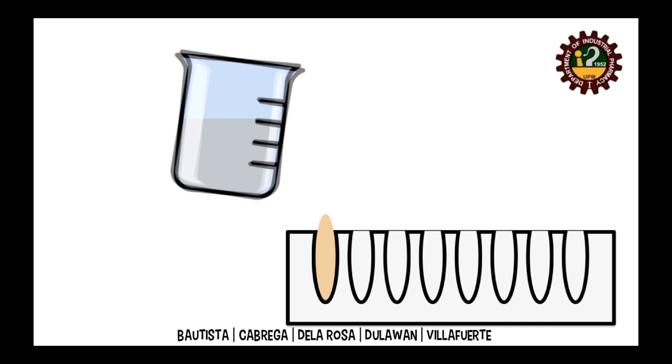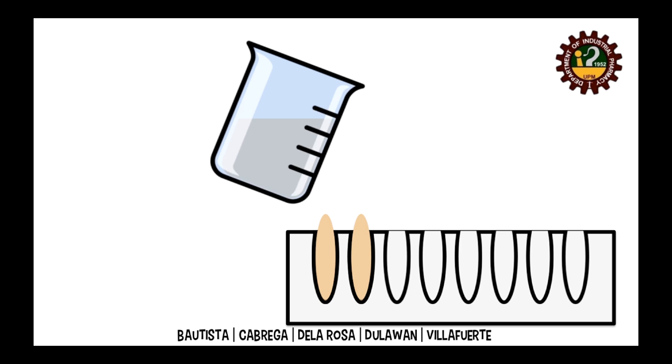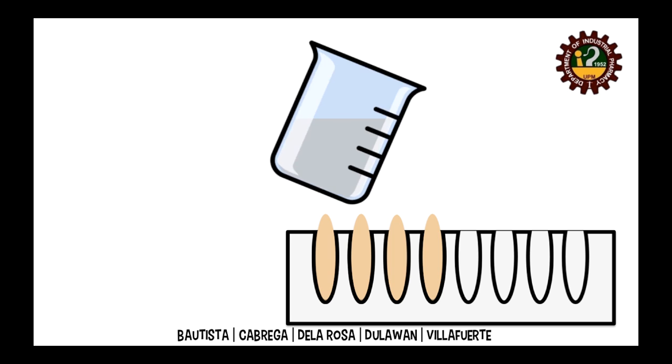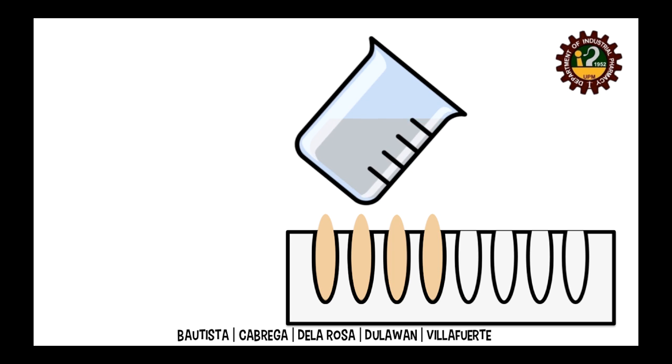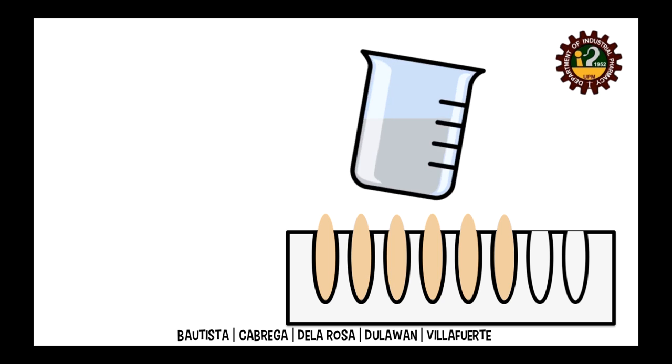Now, the melt can be poured carefully into the mold. Ensure that the pouring is continuous to prevent layering. The pouring is done excessively to ensure that the mold is completely filled upon congealing.